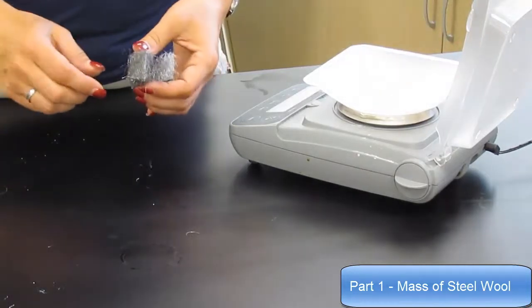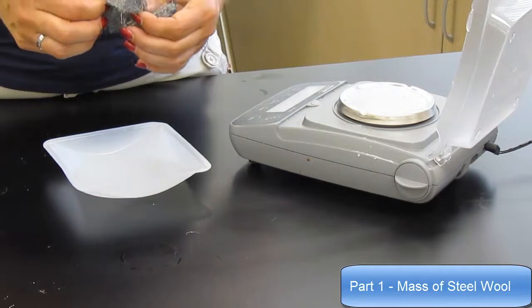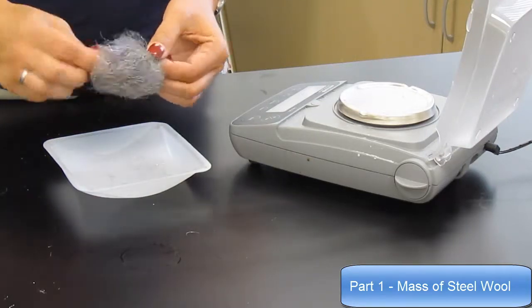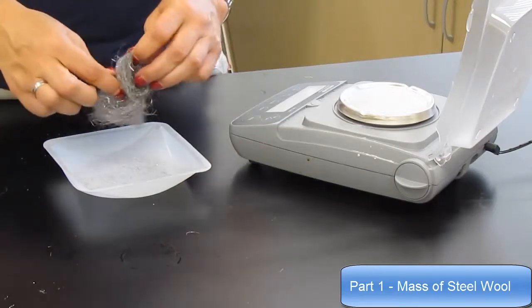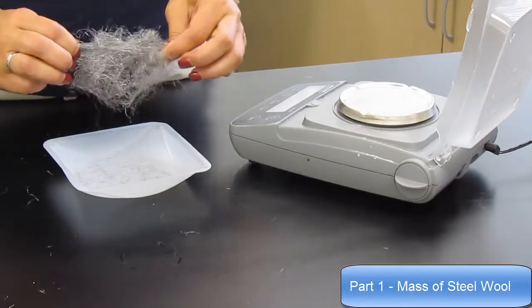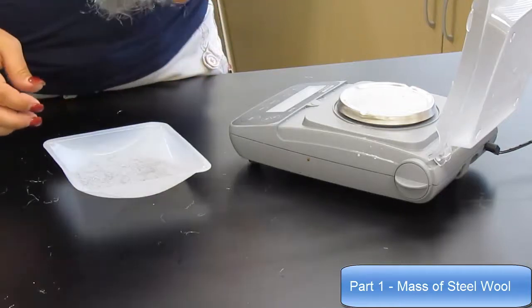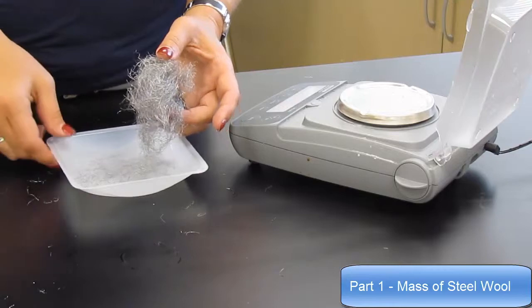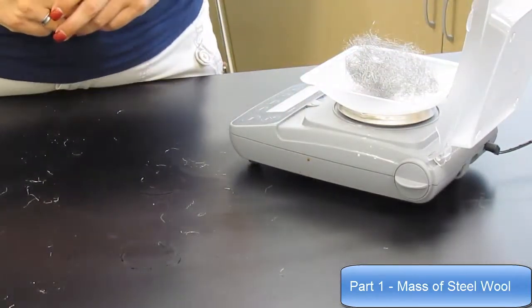Then you're going to take the steel wool and stretch it until it is roughly twice the volume that it originally was. It doesn't need to be perfect, just roughly twice the original volume. Make sure you record any observations that you note. Place the steel wool back into the dish and take the mass again.